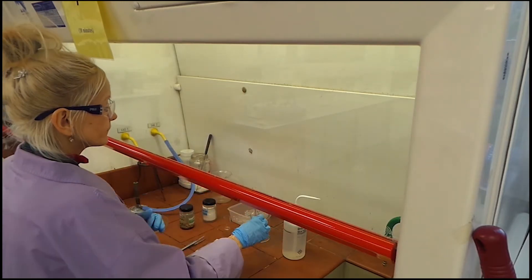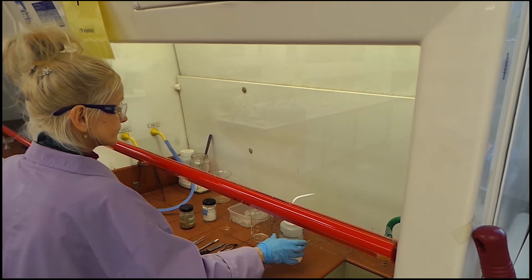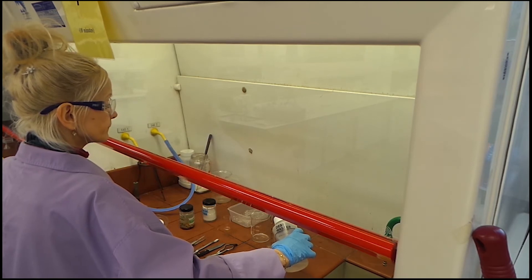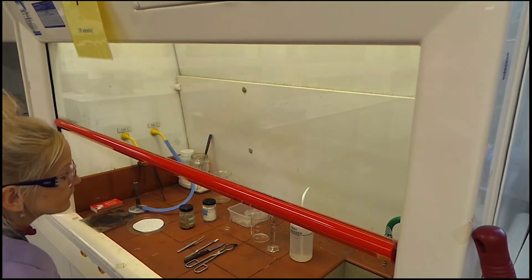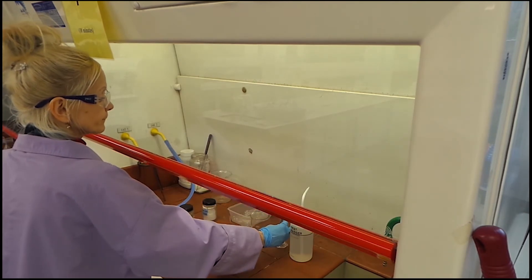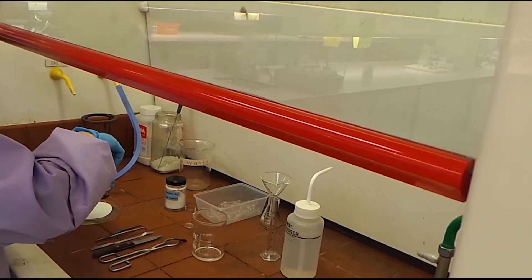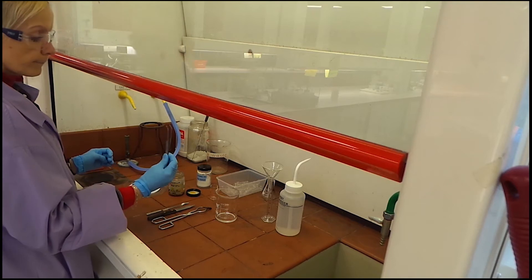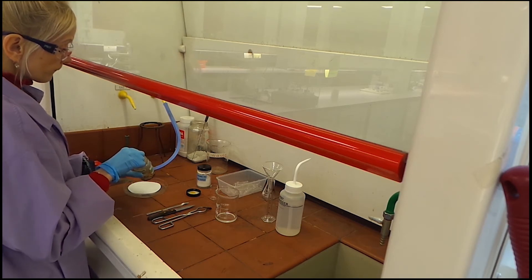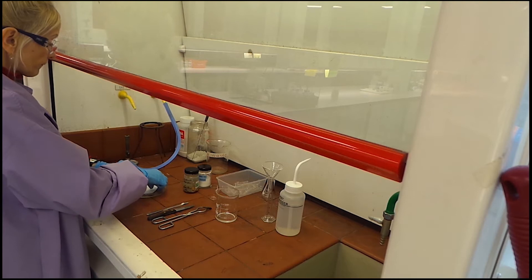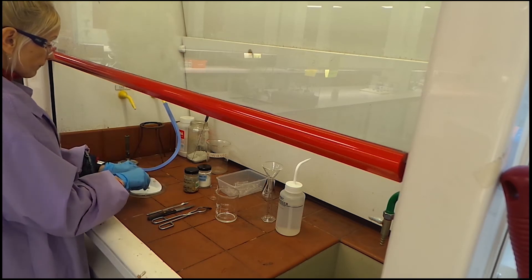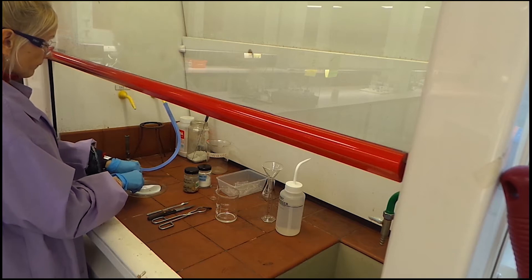Use a graduated cylinder to measure 10 ml of distilled water and then transfer it to a 250 ml beaker. Using a forceps, take a piece of sodium from the storage container and place it on a clean filter.